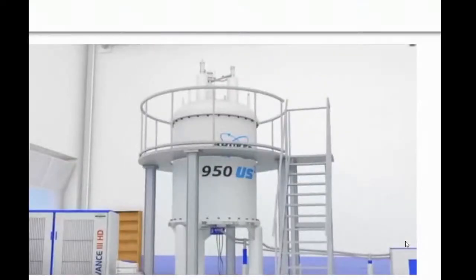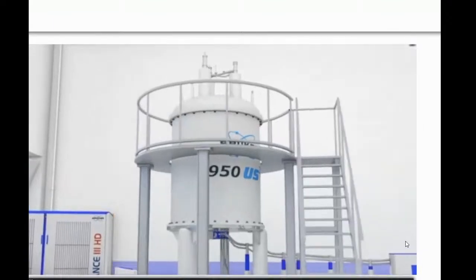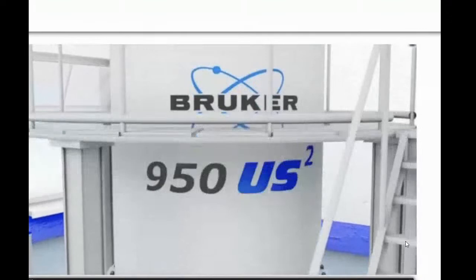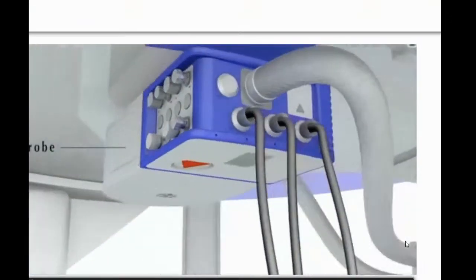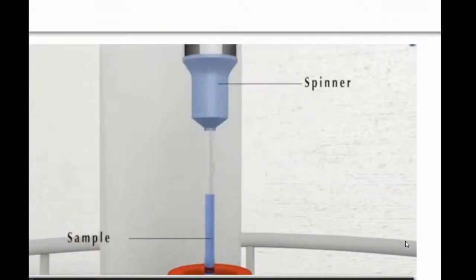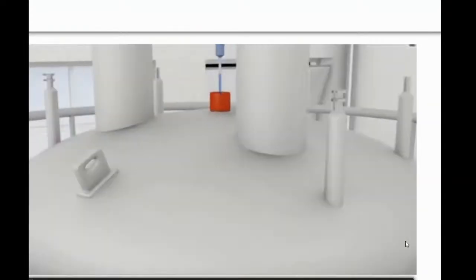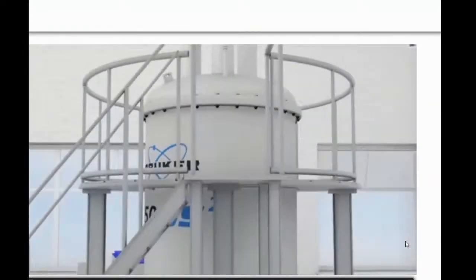Okay, so this is a movie from Bruker. You can see how Bruker, this is a 950 ultra shielded, ultra stabilized. That is the US squared. This is a probe, as I told you. This is a sample spinner, sample tube. Okay, and then it goes on the top. You see that? It goes on the top.